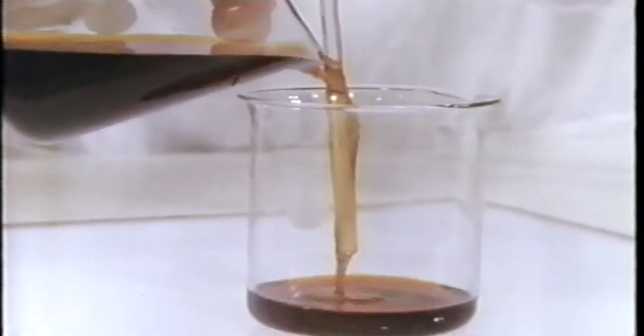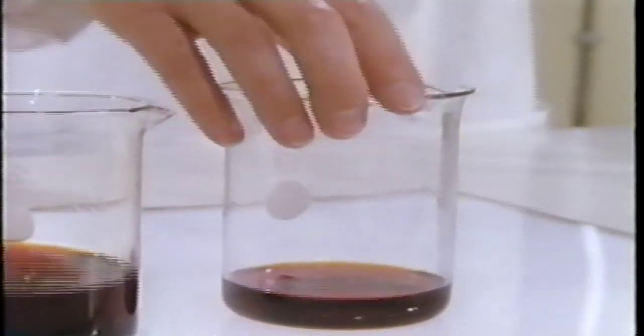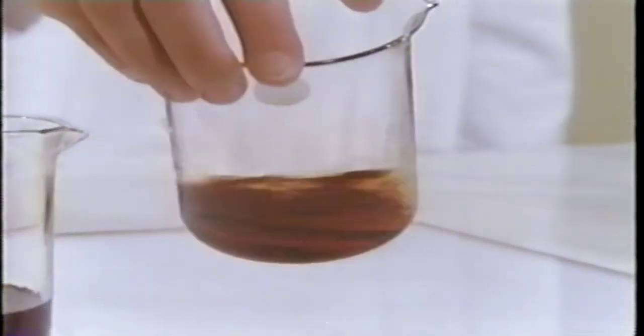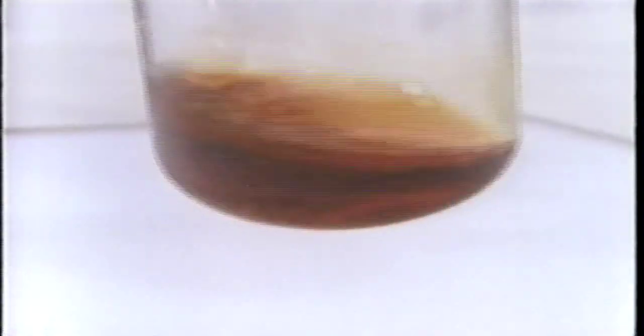There is one more experiment we can try with this iodine solution. Though we didn't show it with our models, a bit of the dissolved iodine reacts with water, forming iodide ion, I-, and iodate ion, IO3-. 3 iodine molecules plus 3 waters react to give 5 iodide ions, 1 iodate ion, and 6 hydrogen ions.